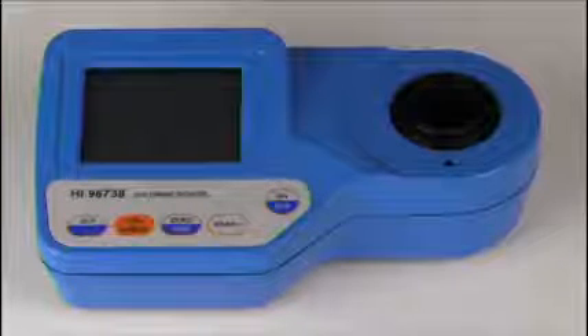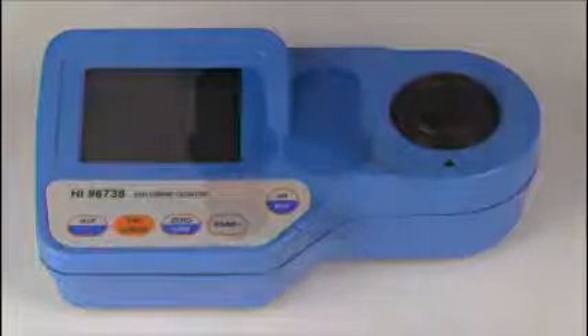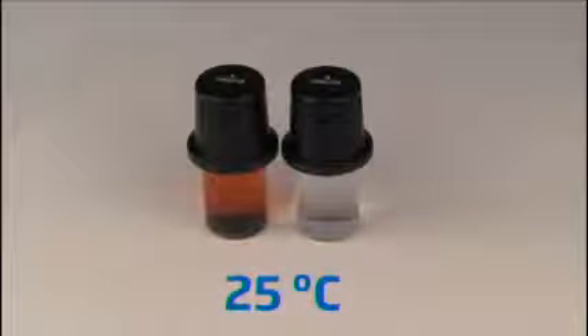This reaction produces a color in the blank, and as the concentration increases, the color of the sample or standard fades. CalCheck standards are designed to be used at a standard temperature of 25 degrees Celsius, and temperature is an important factor in ensuring an accurate calibration check.